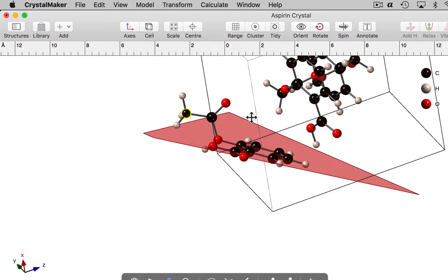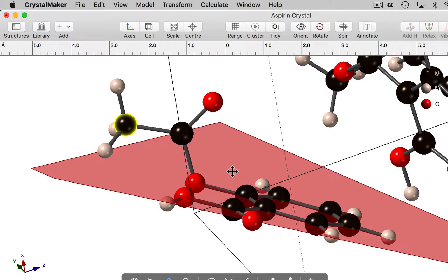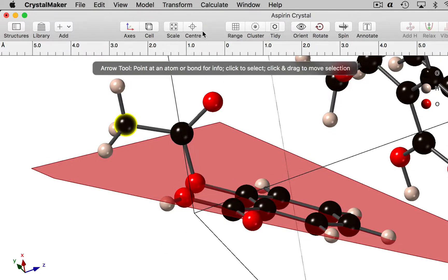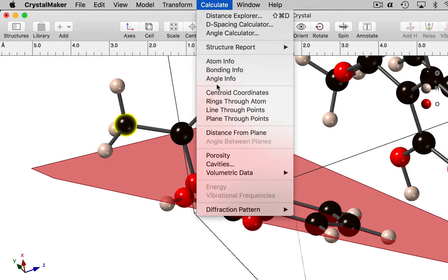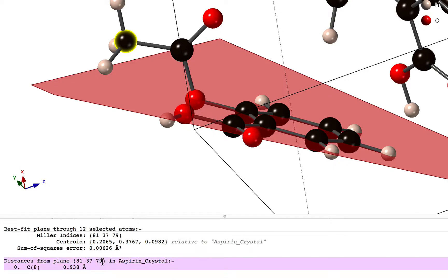So let's just move that to the middle of the screen and we'll zoom in a little bit. What's the distance of that atom from the plane? Well we can use the calculate commands to calculate distance from plane, and again that's displayed at the bottom of the screen. That's 0.938 angstroms.